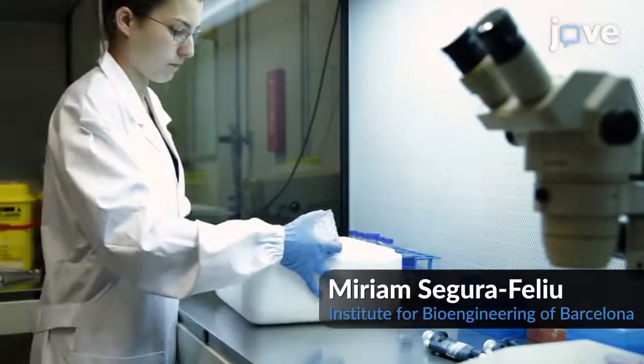The main advantage of this technique is that analysis of the results is quick and simple and doesn't require complex software which would imply extensive training for researchers. Demonstrating the procedure will be Miriam Segura-Feliu, a technician from our laboratory, and myself.